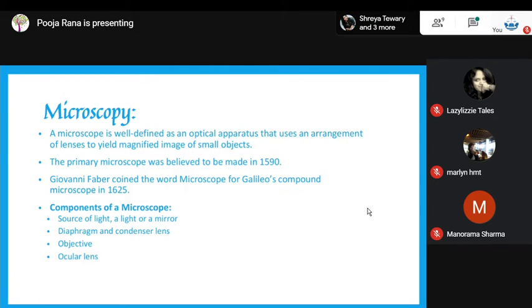Now, optical microscopes are elementary designs of microscopes, and they were designed around 1600. Elementary optical microscopes can be very simple, although there are countless multifaceted designs which intend to advance the resolution and sample contrast. Factually, optical microscopes were very easy to improvise, and they were quite prevalent because they use visible light.